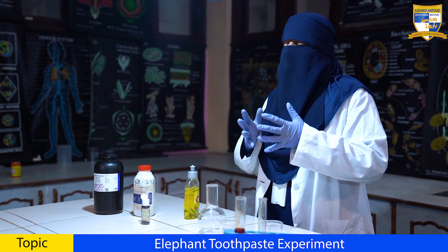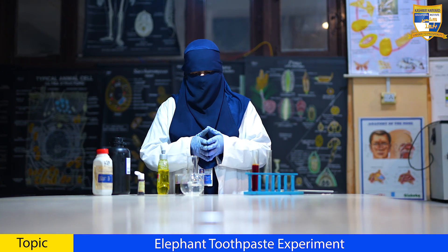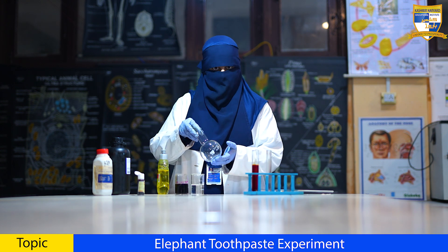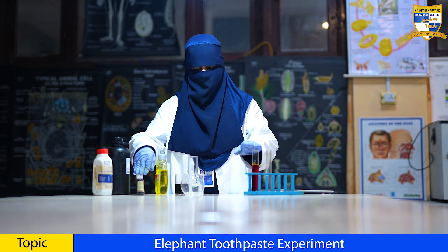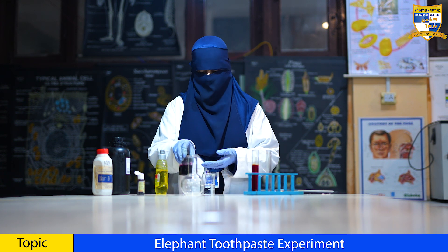Today, we'll be performing an exciting and incredible experiment, namely the elephant toothpaste experiment. For this experiment, we'll need some equipment and chemicals to make it happen. We'll be using a round bottom flask, dish soap, two different food colors, hydrogen peroxide, and potassium permanganate.